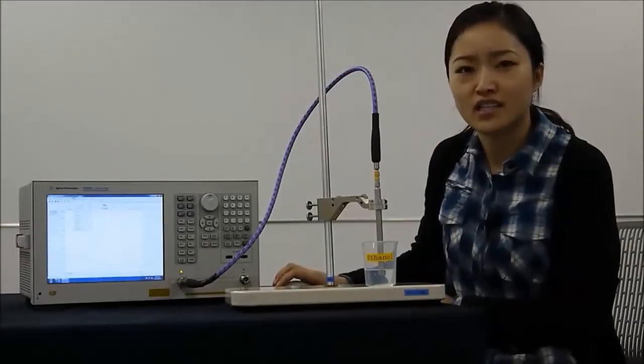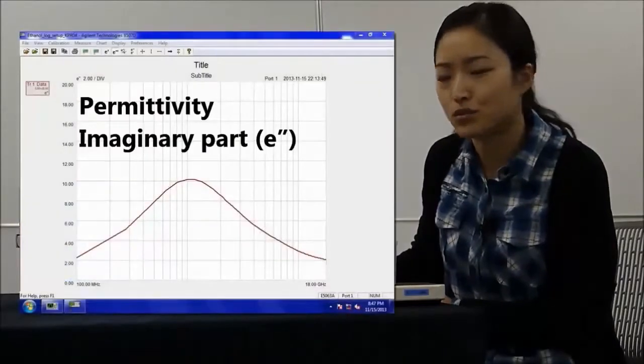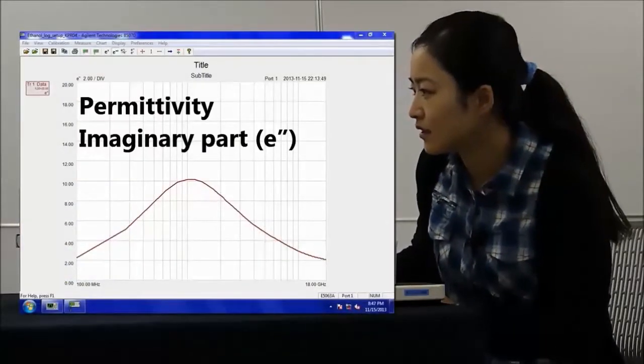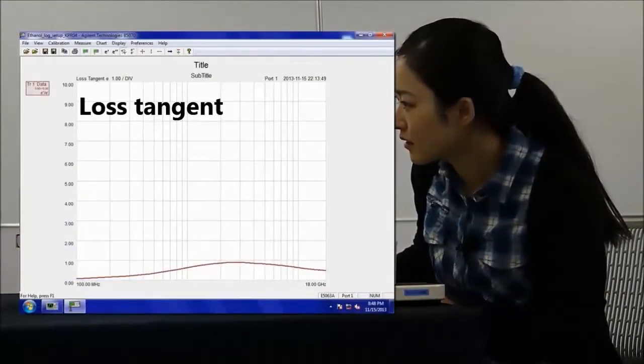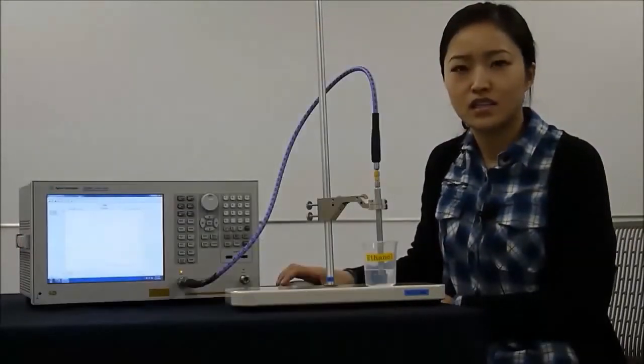Click chart. Now we can look at the imaginary part of permittivity, loss tangent, and Cole-Cole plot.